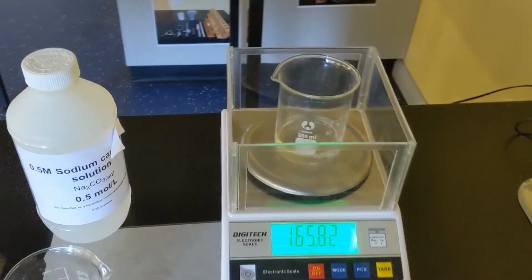That can happen. Sometimes balances can settle out, and you might have to make an adjustment there. Usually it's recommended that you leave the balances to adjust for a minute before you actually take a reading.